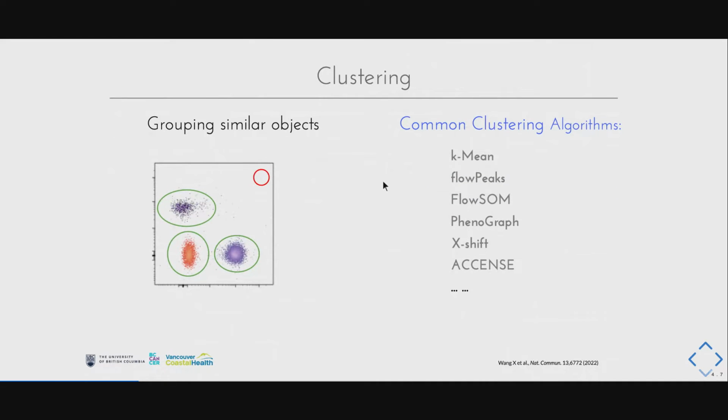And then we have the unsupervised clustering algorithm. Flow cytometry data analysis is often cluster-based. We never make a conclusion or diagnosis based on a single data point, but rather on the group of similar cells, like we showed here.